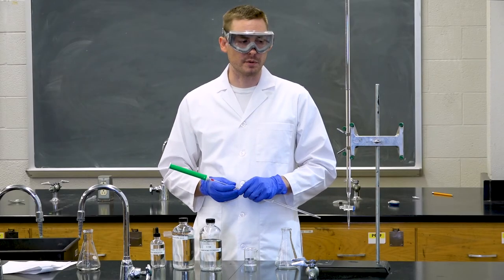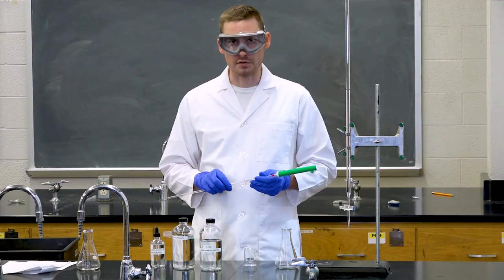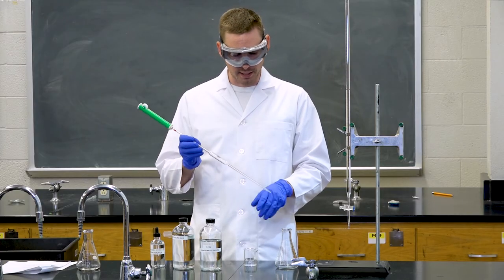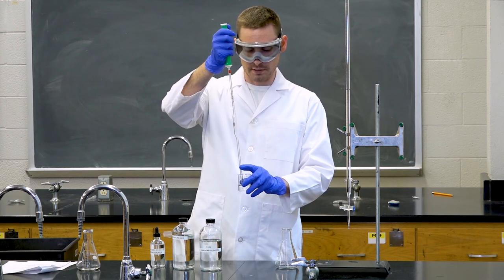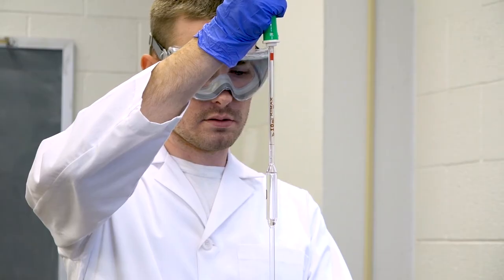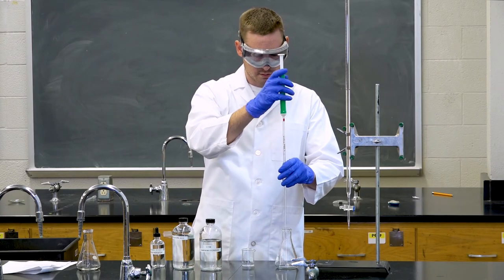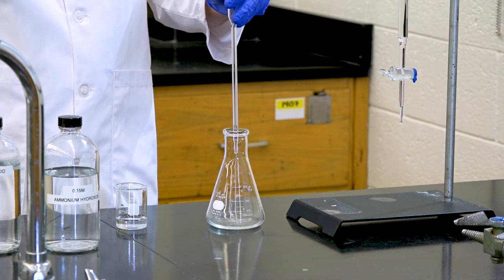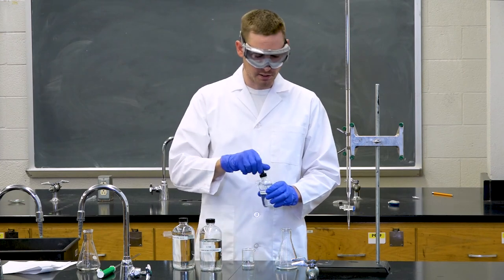So for the third part of this experiment, we're going to be repeating the titration, but this time we're going to be using ammonium hydroxide as our base and sulfuric acid as our acid. So once again, you'll need to rinse your volumetric pipette before adding the acid to your Erlenmeyer flask. We've already rinsed this one, so we're going to measure out our sulfuric acid, 10 milliliters, and then add it to our Erlenmeyer flask. We can then add 2 drops of our indicator.